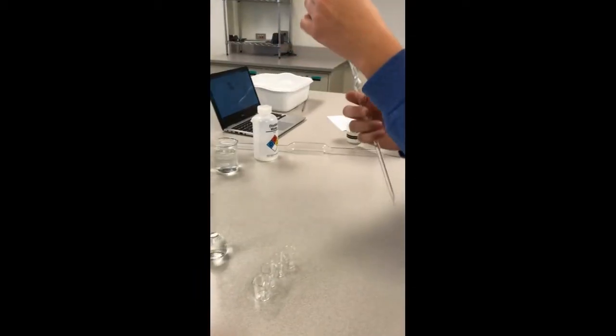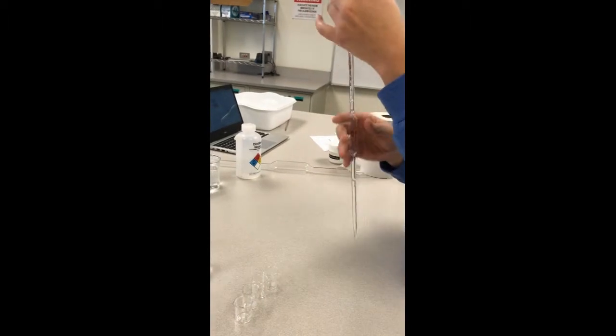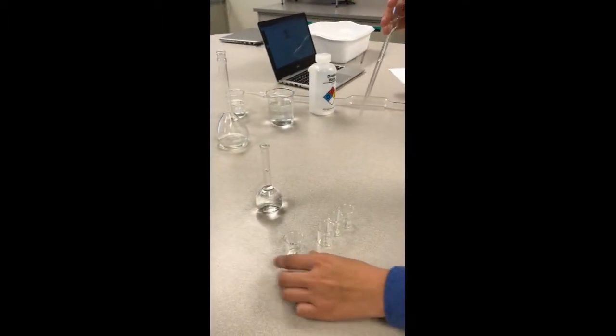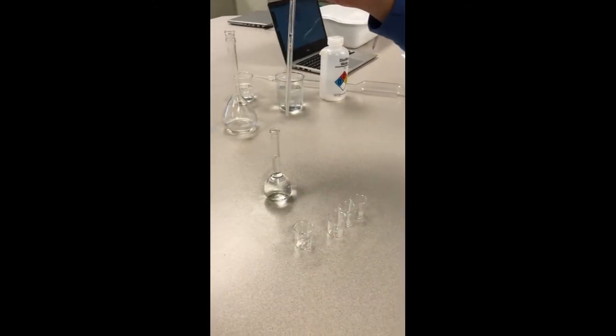A 10 milliliter volumetric pipette, and we're gonna take 10 milliliters of the solution and put it into our 10 milliliter beaker.